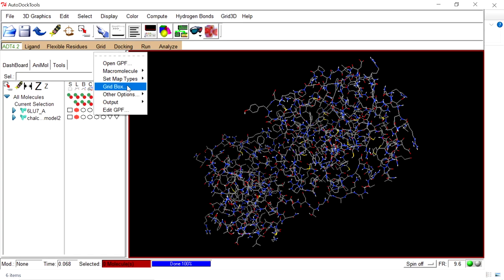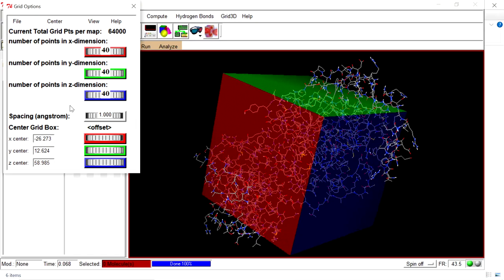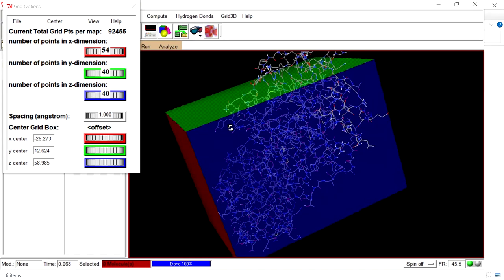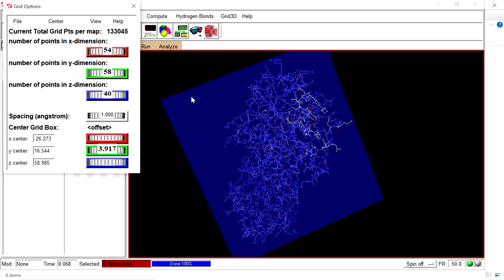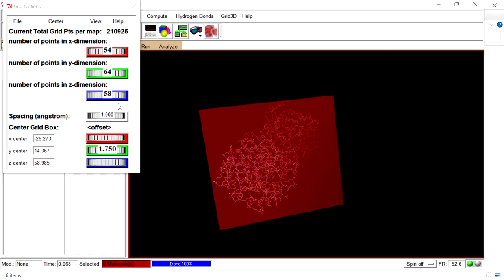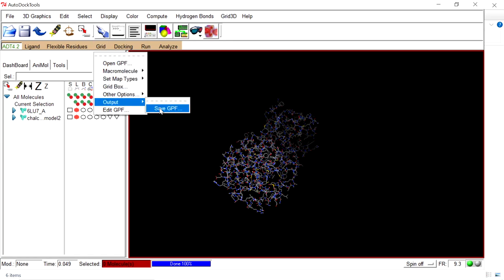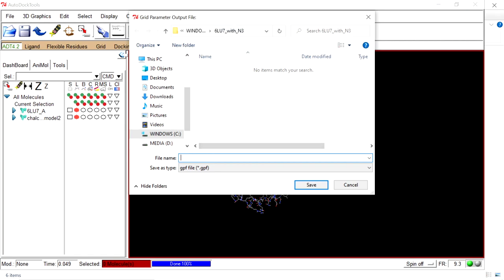Next, go to Grid and Set Grid Box. Adjust the parameters to cover the entire macromolecule, or if you know the active site, set the grid box for only that region. Change the spacing — set it to 1 Angstrom. Now the grid covers the macromolecule in all directions. Go to File and close, saving the current settings. Then go to Grid, Output, Save as GPF. Name the file grid.gpf and save it in the same folder.